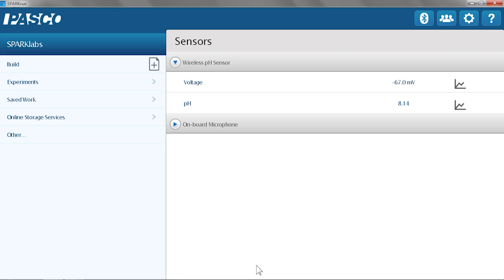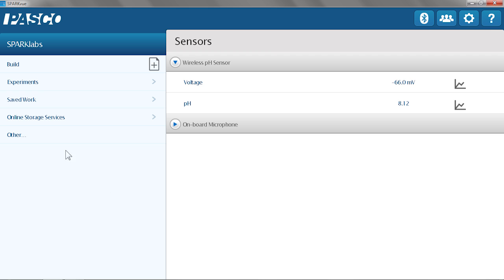Right from the home screen, I can actually see the live measurements. You can actually do this whole experiment right from the home screen, putting it into different household chemicals and monitoring and recording those pHs. We want to provide a little more structure for the students, so we're actually going to open up a SparkLab, which is a pre-configured file to guide the students through the experiment.